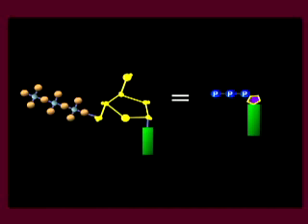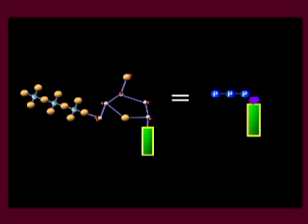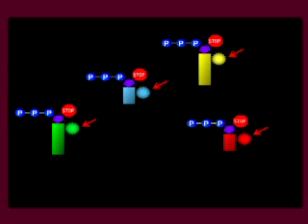The bases are represented by a pentagon for the sugar backbone, a circle with a P for each phosphate group, and a rectangular box for the base A, T, G, or C. In the sequencing reaction, every base is labeled with a different fluorescently colored dye, represented by a star, and has a 3' terminator represented by a stop sign on the 3' carbon that keeps the reaction from proceeding beyond a single addition.